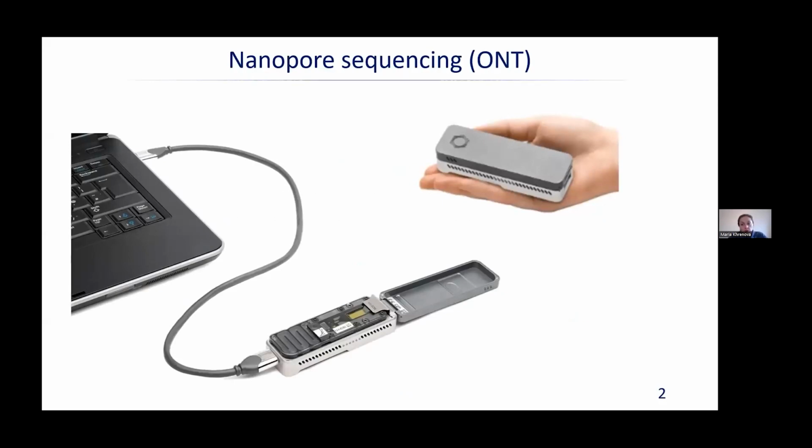The first part of my talk will be devoted to nanopore sequencing. It's quite a new technique, and as for me, it's really a sort of revolution in DNA and RNA sequencing.